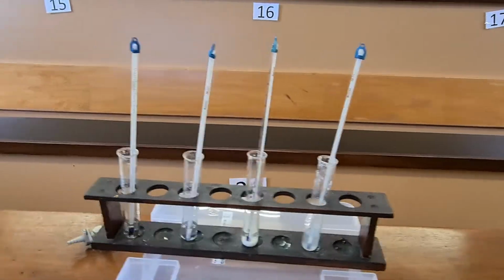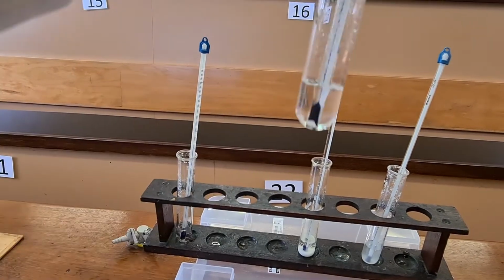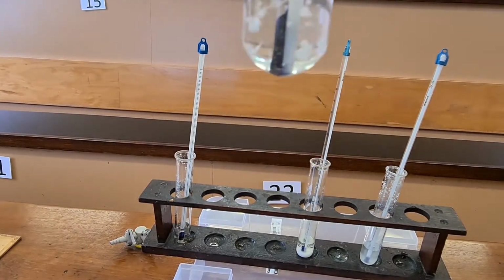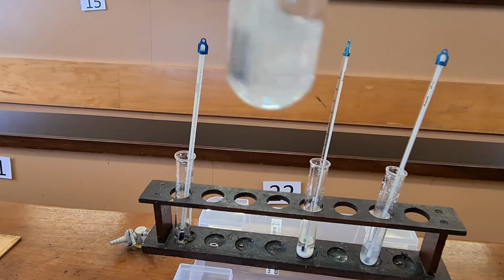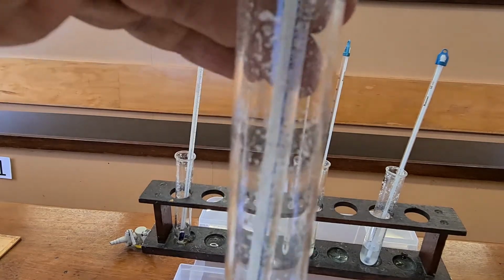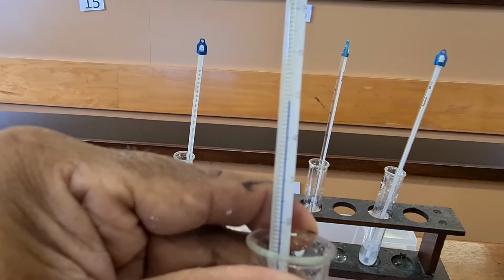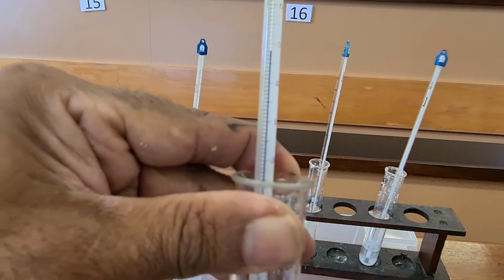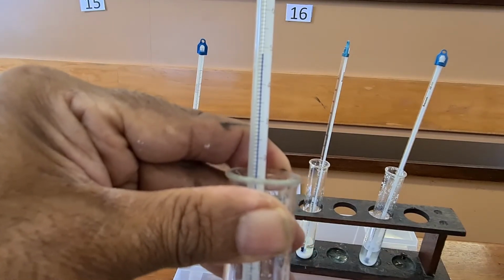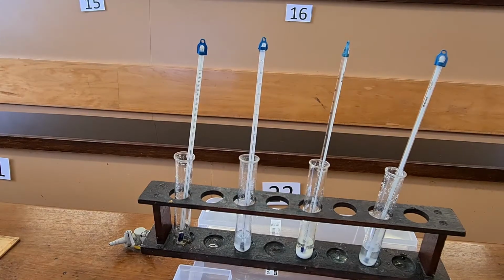Now, keep your eye on those last two. There. That B, test tube B, is starting to form crystals at 48, 49, 48, 49. Sorry, parallax error. 49 degrees. So B is 49 degrees.